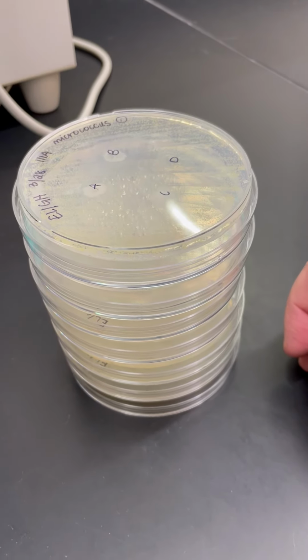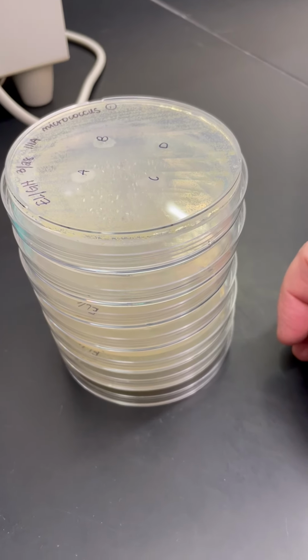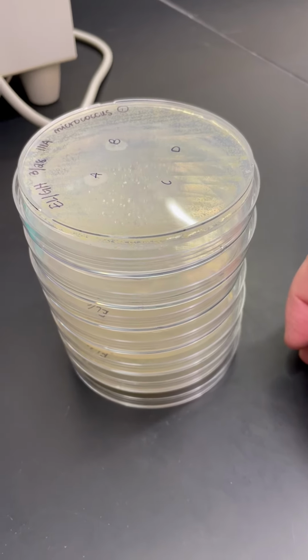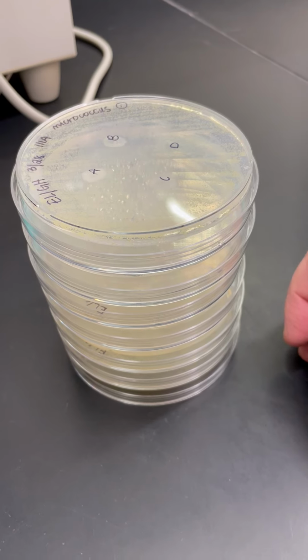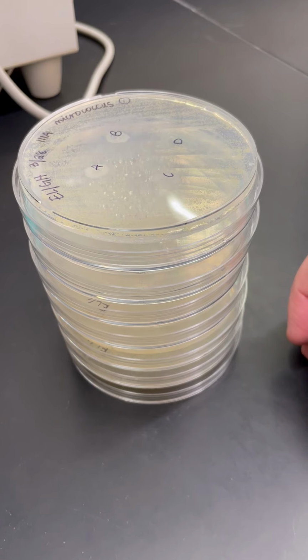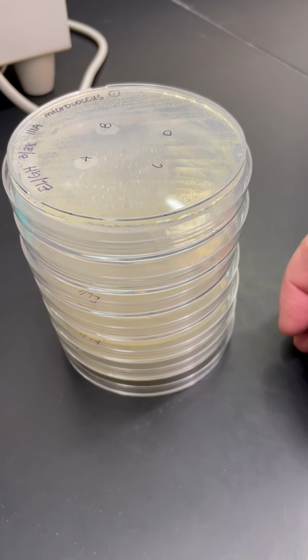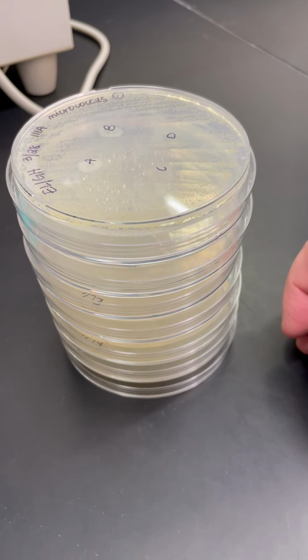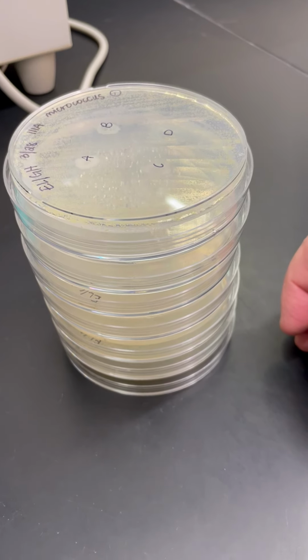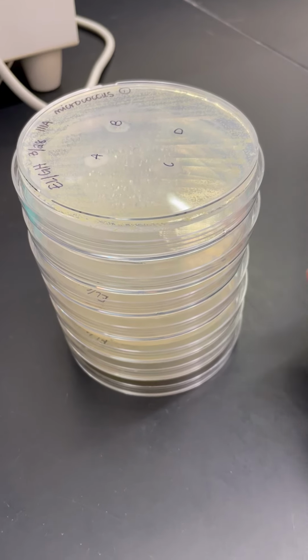But the result is you're going to be able to evaluate how well each of your 4 isolates do against a variety of different bacteria. And to remind you, these bacteria are actually relatives of things that cause disease. So in any event, that's what I wanted to tell you there. And I'll probably share a photograph of the background situation with Staphylococcus.